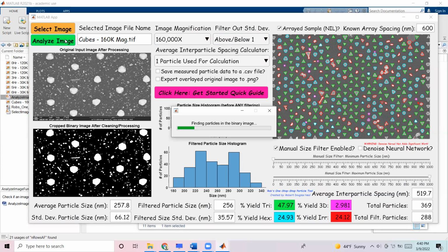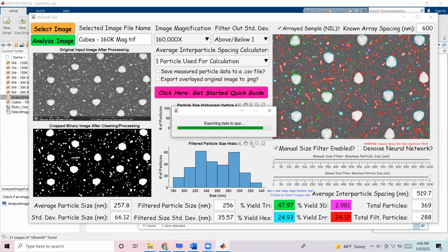Oh, I think I missed the analysis button. Oh no, there it goes. It was just taking a second.